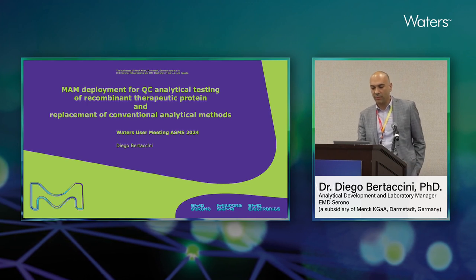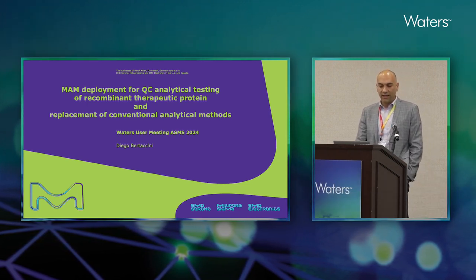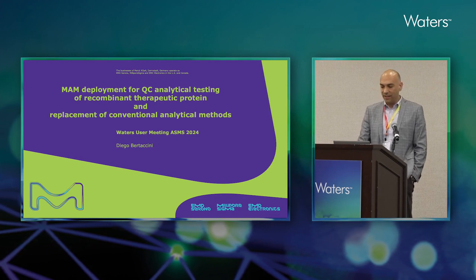So I'm going to be talking about MAM deployment in QC for analytical testing and replacement of conventional analytical methods.